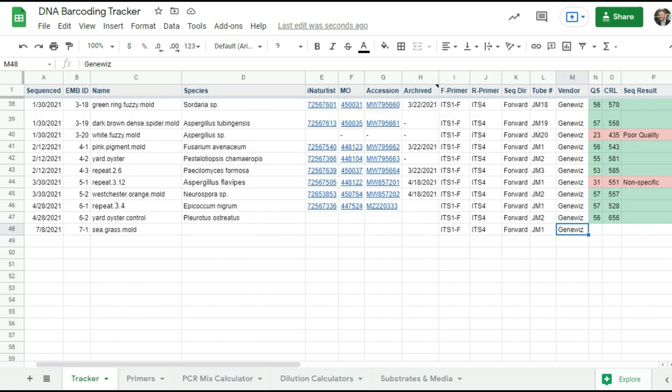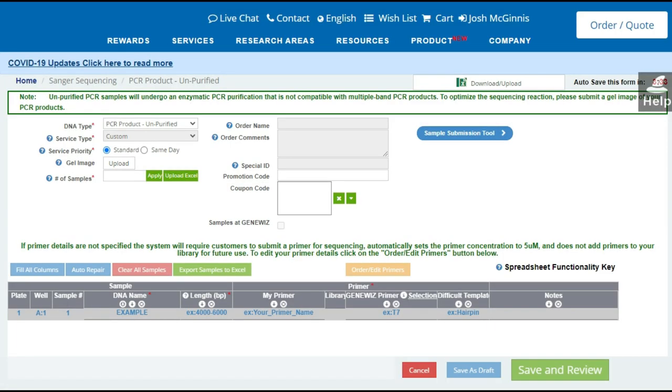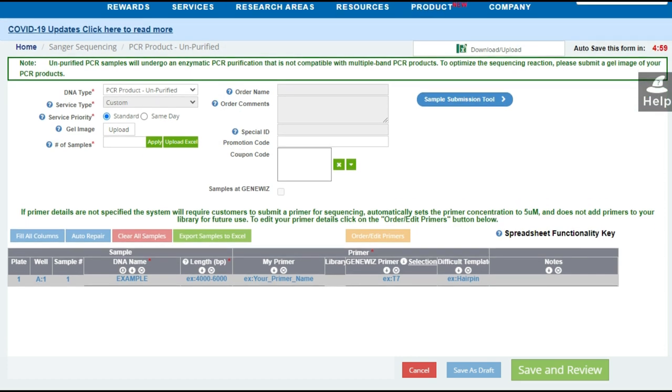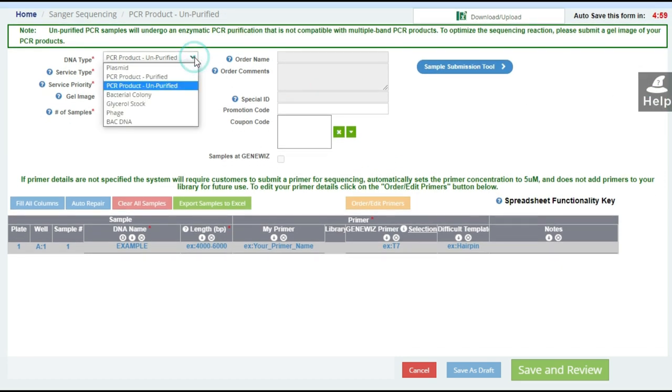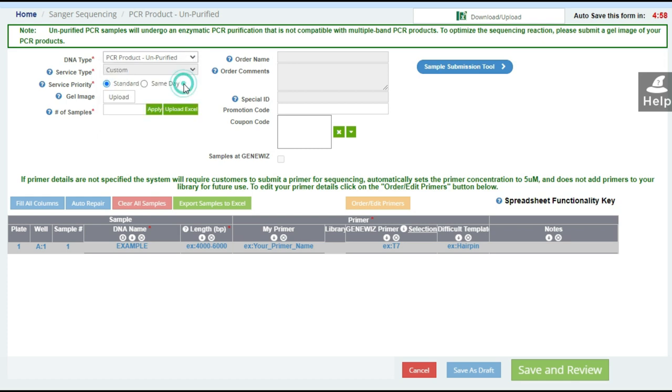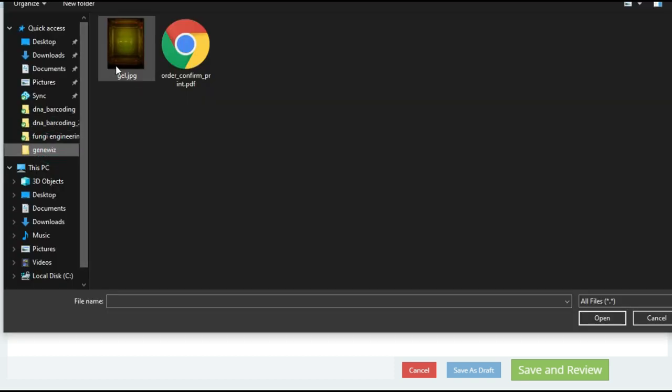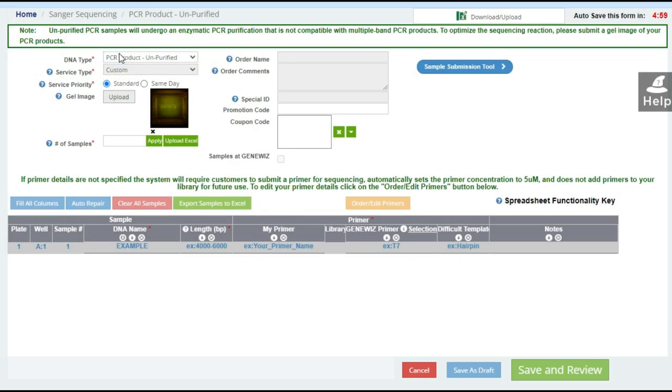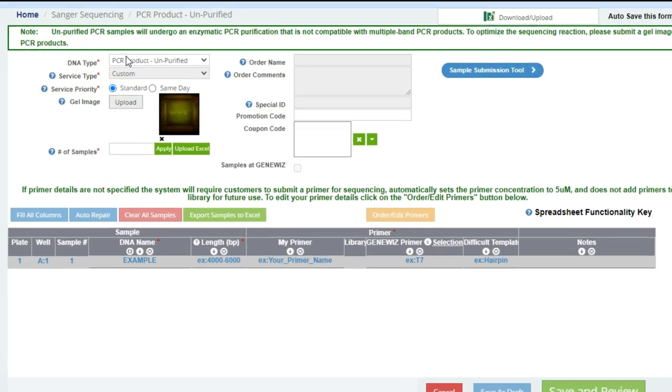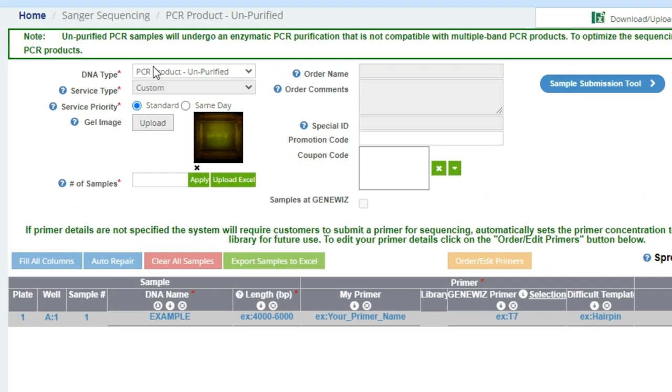So if we go back to the order form, you'll see that the upper left-hand field, and we'll just go through each one here, the DNA type is a PCR product, it's unpurified. Service type we cannot change. Service priority is just standard unless you wanted to do it the same day. We also need to upload the gel image from the PCR reaction, and we'll come back to why we need to do this later.